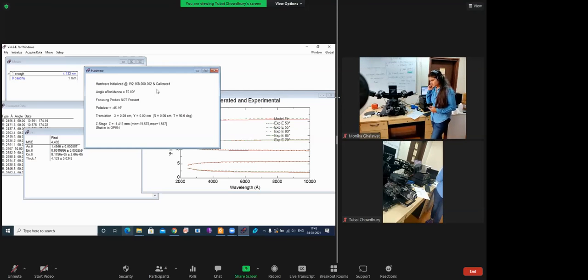Hello, can you come again, please? Ma'am, we use soda lime glass. Soda lime glass, okay, thank you so much. Any other kind, quartz, sapphire? Soda lime glass and ITO.